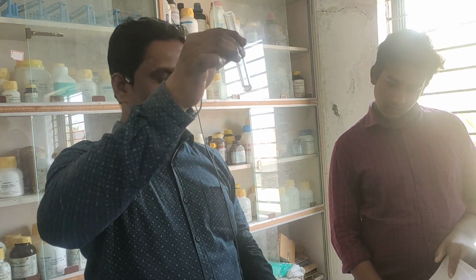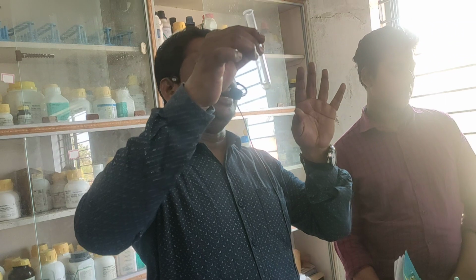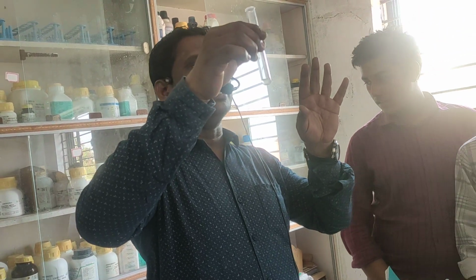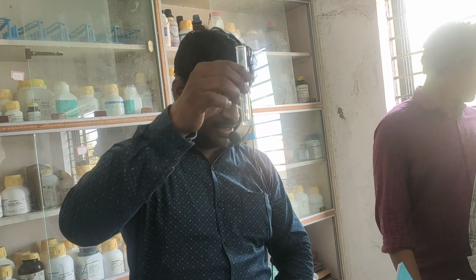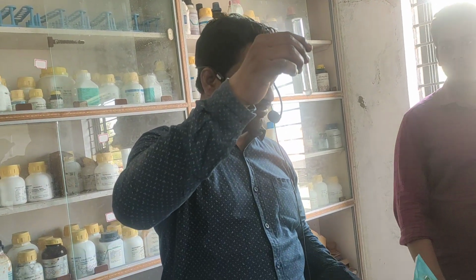Okay, so up to now what have you detected? The anion. What is the anion? CO3 minus 2, this is the anion. Now let us go for the group table.